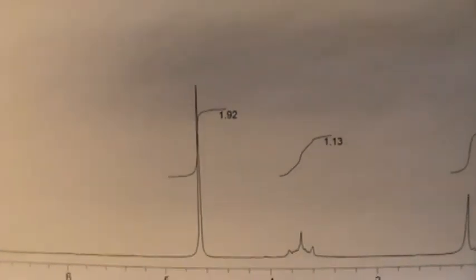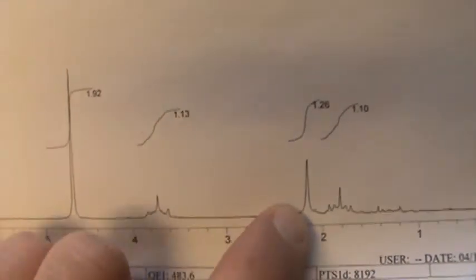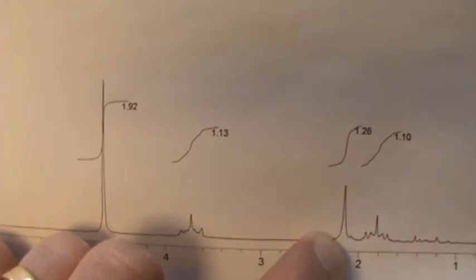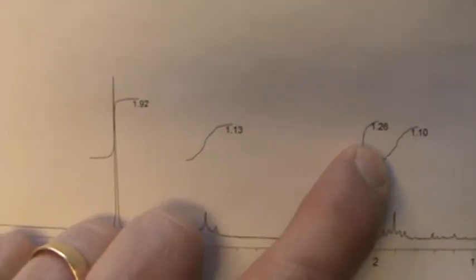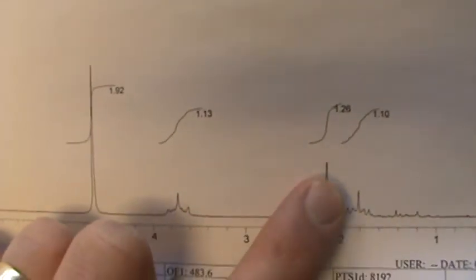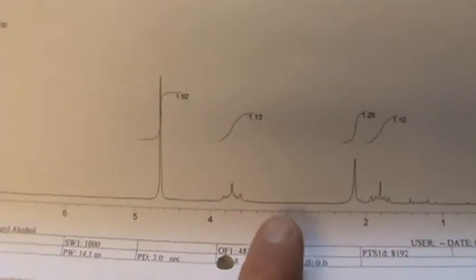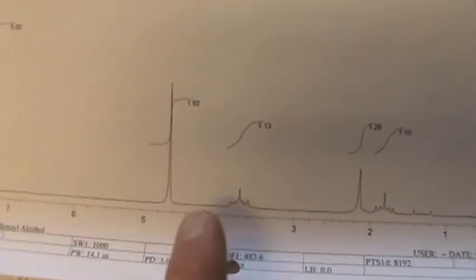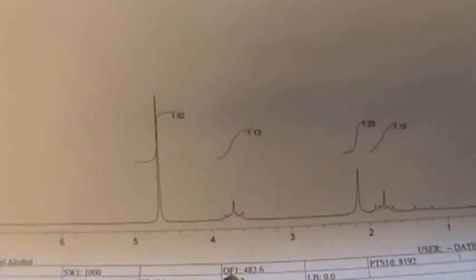And lastly, Elena and Joanne, they get a very nice singlet there at 7, a nice singlet at 4.6, small amount of THF. This peak at 1.26 down at 2, acetone, water maybe. An OH being that far down could be 2, but see how the integral is 1.26. Can't tell definitively. Normally OHs for this compound and all the other students normally seem to be found to the left of 3. So whether that one is actually the OH of the compound, don't know for sure.